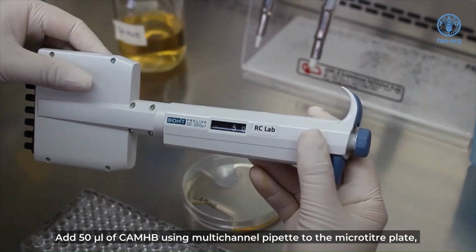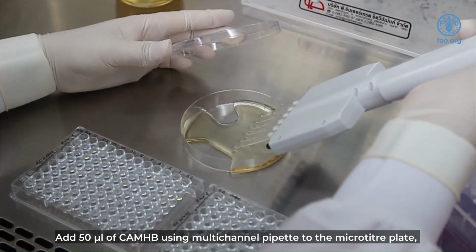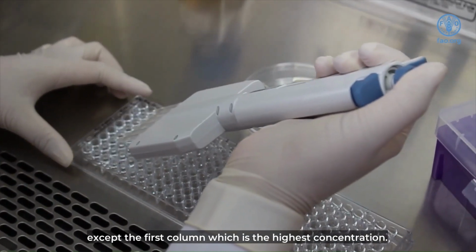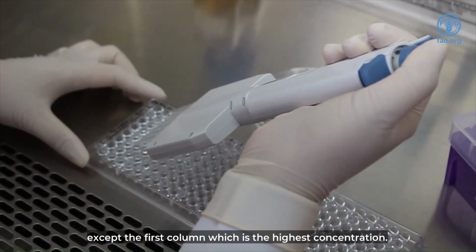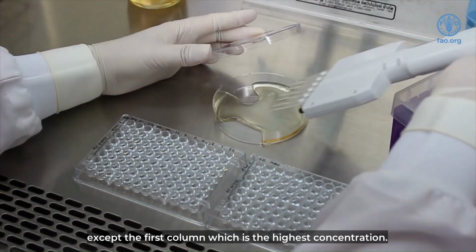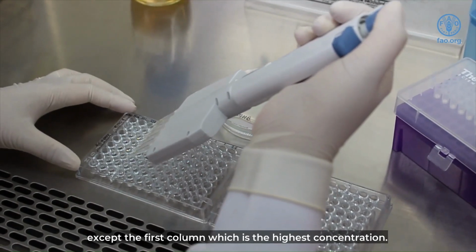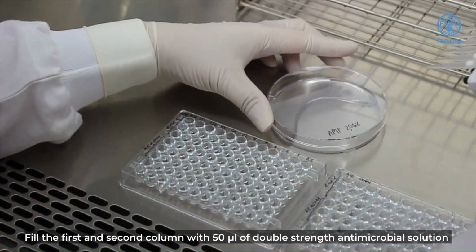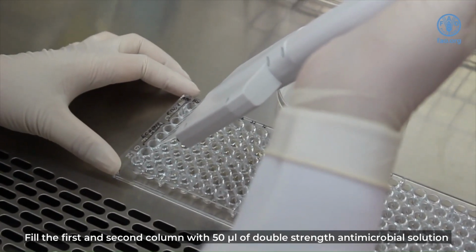Add 50 microliters of CAMHB using multi-channel pipette to the microtiter plate, except the first column, which is the highest concentration. Fill the first and second column with 50 microliters of double-strength antimicrobial solution.